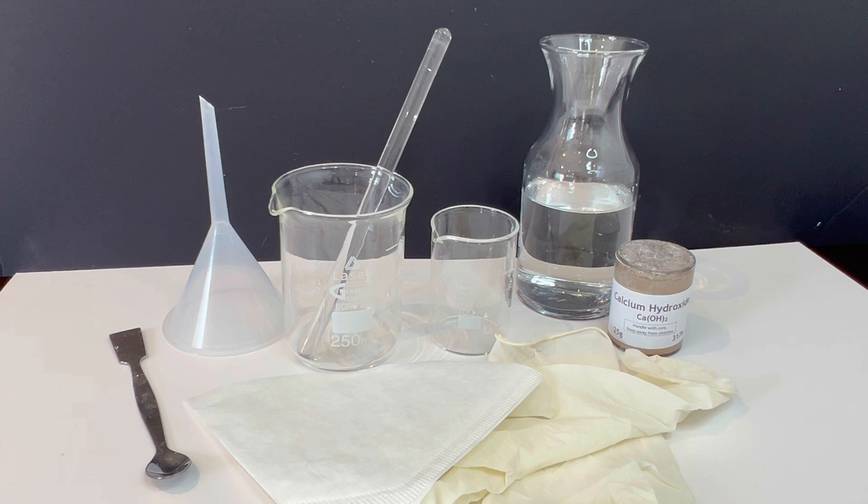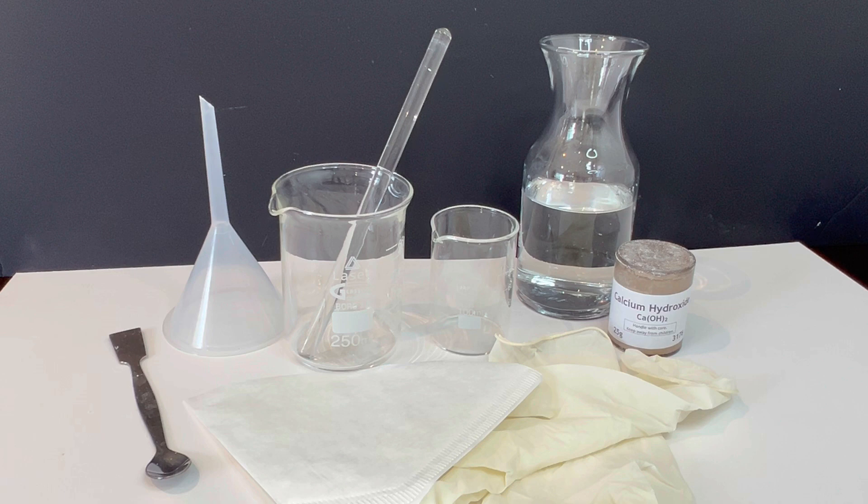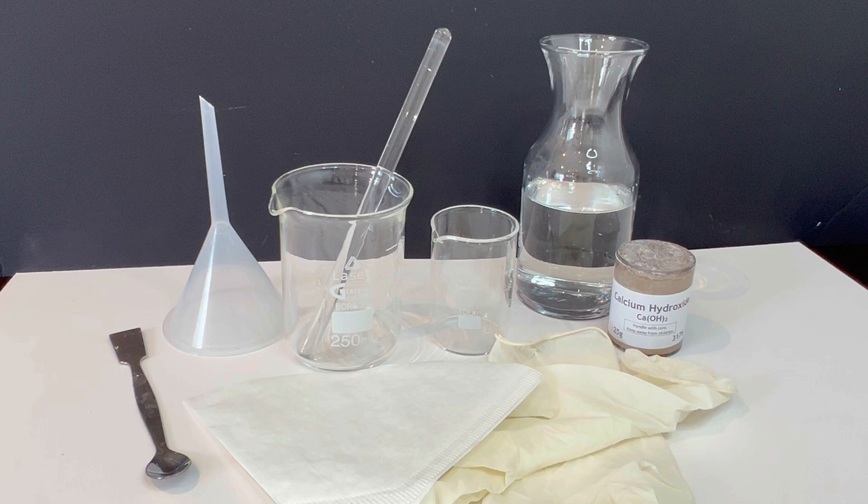Now to prepare lime water, you will need the following materials: calcium hydroxide powder, also known as slaked lime, water, a beaker, a glass rod, filter paper, a funnel, a second beaker, and safety goggles and gloves.